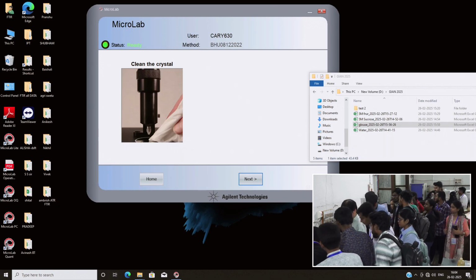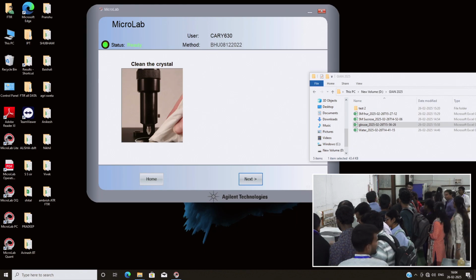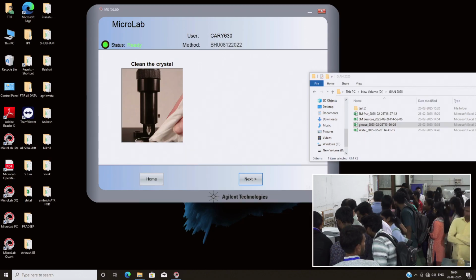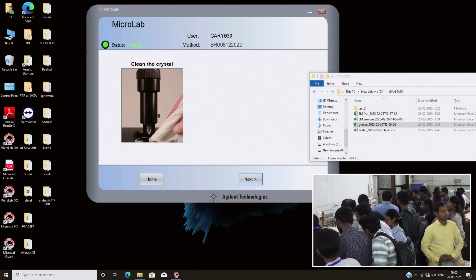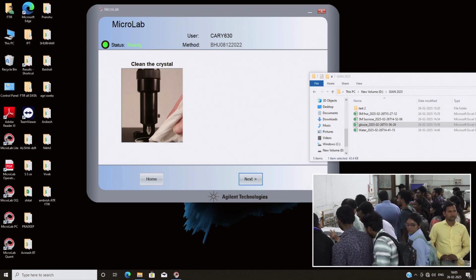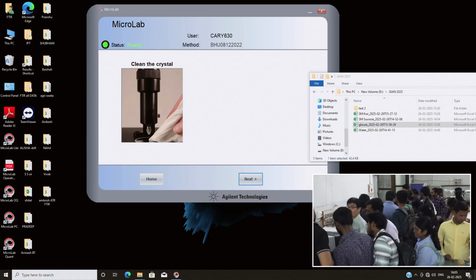For now I cannot say what the origin of this is. Let's check the literature first. As long as this is not a brand new molecule, there must be some information in the literature. And also, in order to make sure of the assignment, we may introduce a stable isotope to induce a peak shift and check whether it is the expected shift or not. Then we can confirm the assignment. Okay, that's it.